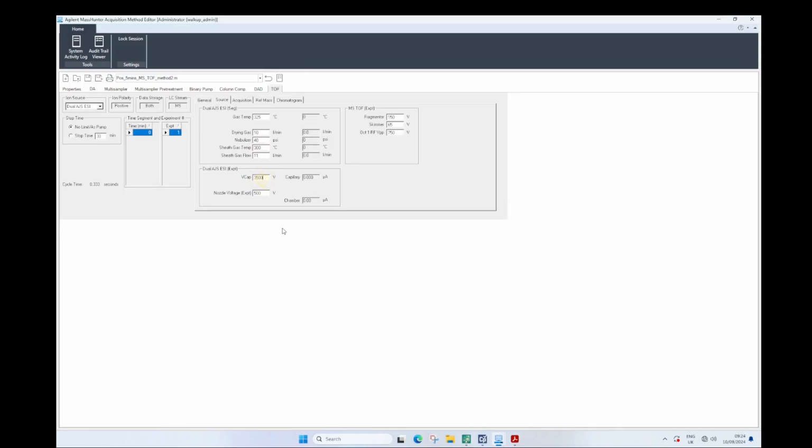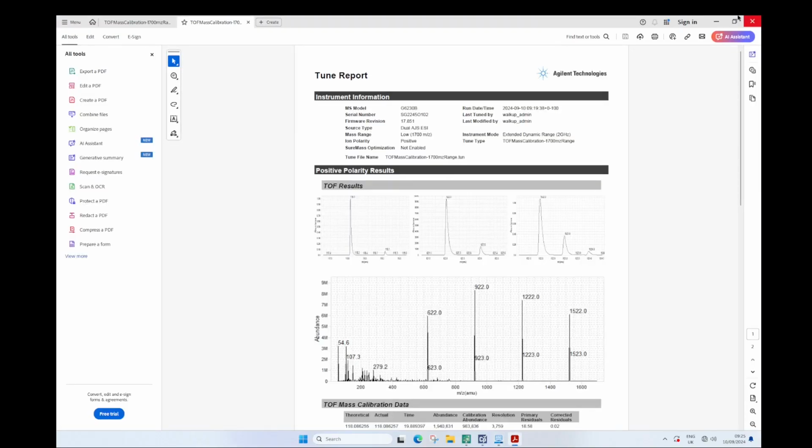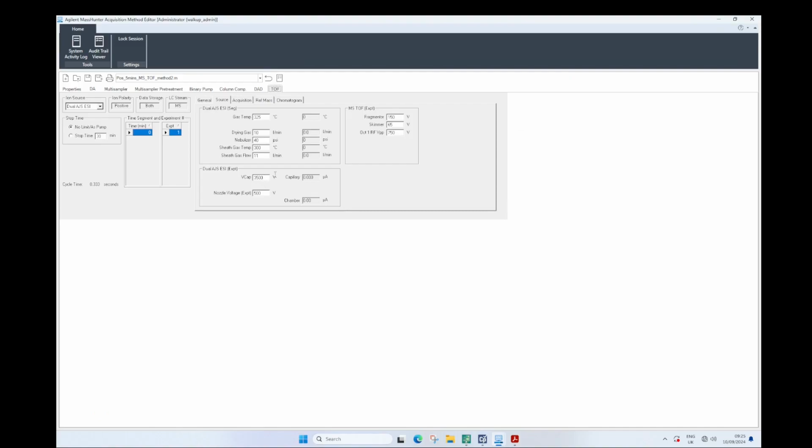With a VCAP, remember that's the capillary voltage inside the mass spec, the first part of the vacuum, where we transfer charged analytes into the deeper parts of the mass spec. That's the voltage gradient. At the tip, it's 3500, and it's often measured in conjunction with the fragmentor voltage, which is at the back. How big of a voltage gradient is there? It's 3500, going all the way to the fragmentor voltage, which is 150 at the back end. So typically we start with 3500, fragmentor 120, 150.